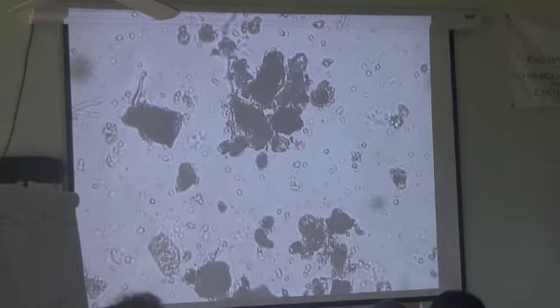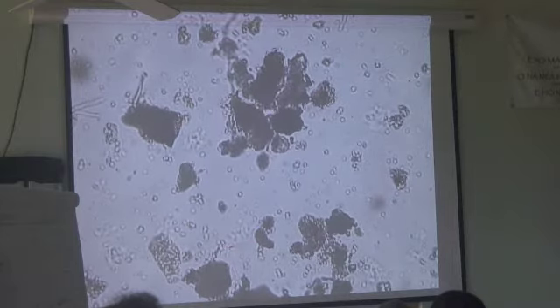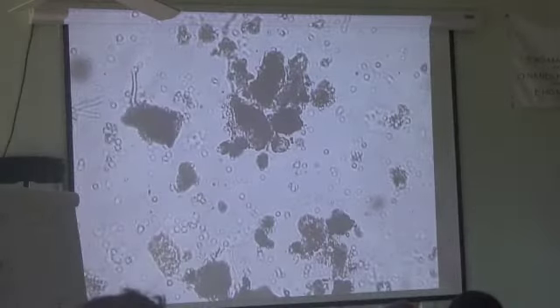Probably what we're looking at is a bacterium getting real pushy, and it's just pushing that whole little aggregate. Here goes the flagellate. See how he was bubbling? That rear end was going. So we've got two flagellates in this field. Now here's another actinobacterium. Narrow diameter, so we've got a whole load of actinos in here. Here's another one. So we've seen good actinos, we have a lot of bacteria, we've got a flagellate. Oh, there's a ciliate. Whoa! So how many ciliates is that in this field? Two. Okay, so we're done counting that one.